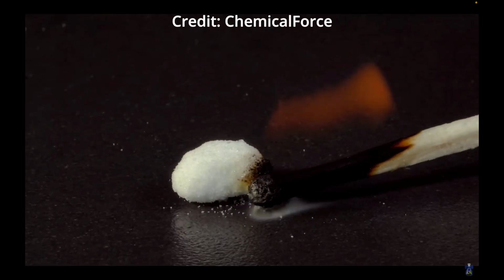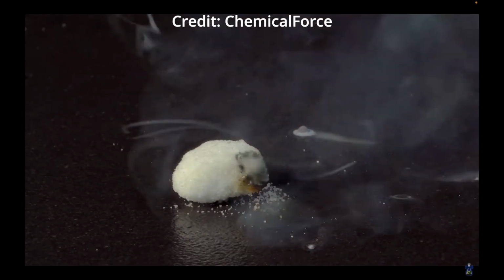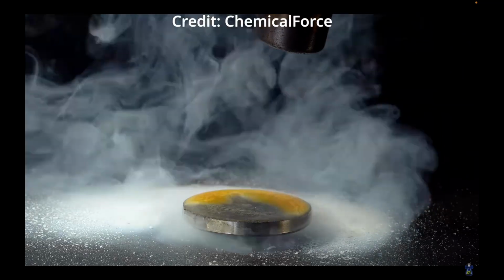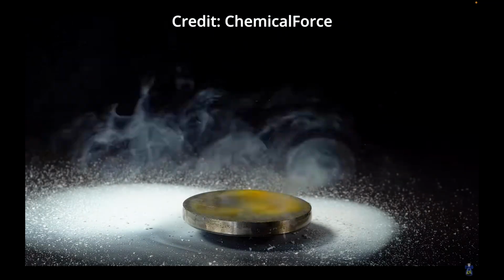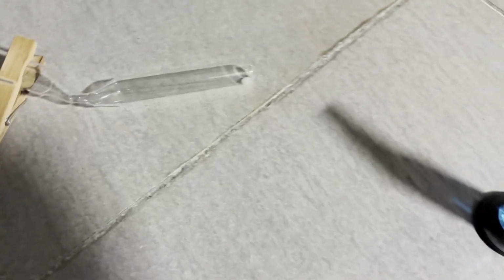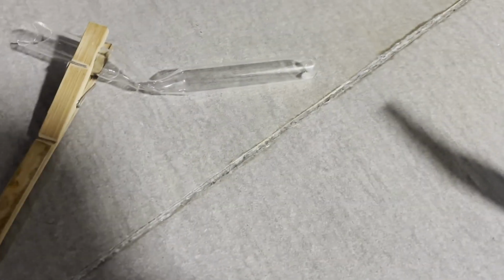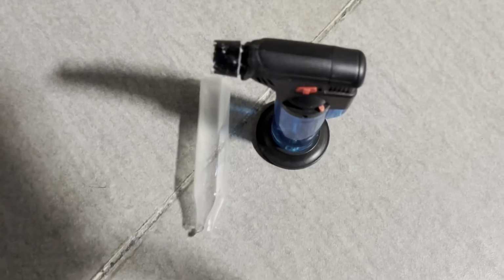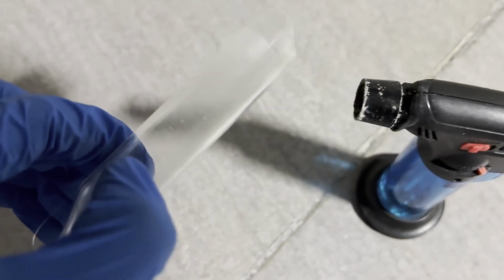Unlike sodium azide, which decomposes readily when in contact with flame, potassium azide melts before it decomposes, which renders it much safer. Still, it's an azide, and azides can explode, so I only loaded 2 flakes of potassium azide into a test tube. After carefully heating it to expel all remaining water and alcohol, and strongly heating to decomposition, a flash of potassium vapor was released that coated the interior of the tube.